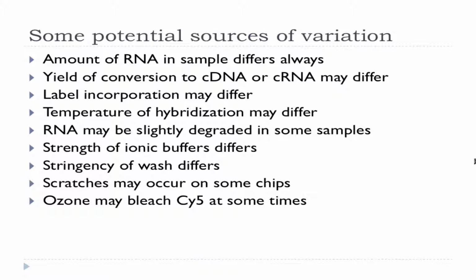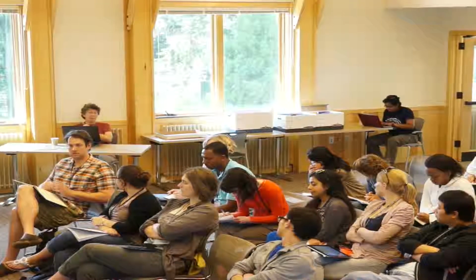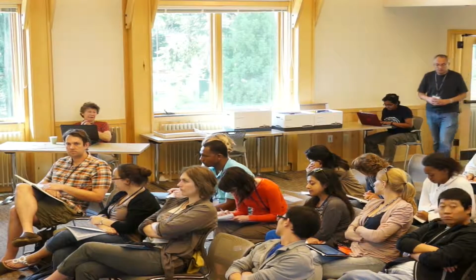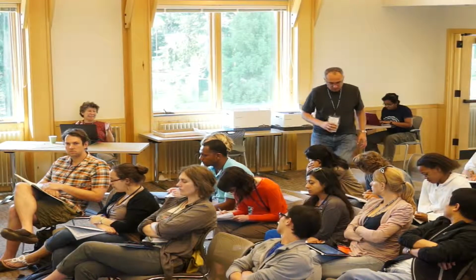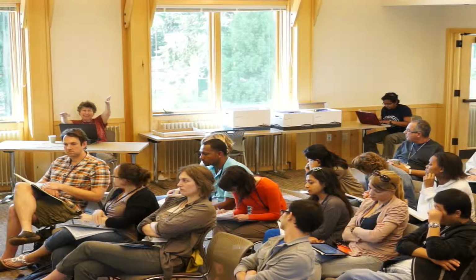Naomi? Yeah. So there's something in some of the software called the RNA degradation plot, and one of the questions people always ask me is, well, gee, it looks like there's terrible degradation in my sample, but really you should think of it as an average 5' or 3' plot, and each array has a characteristic because of where the probe locations are. So on some arrays, these are very flat like that, but on some of them they do have a tilt, and that doesn't mean your sample is bad. It's a characteristic of the array.